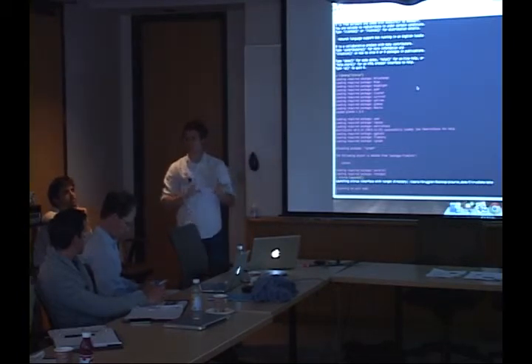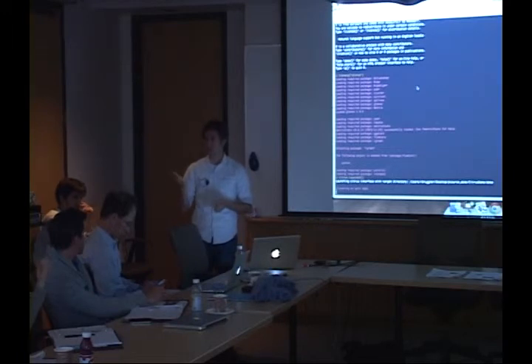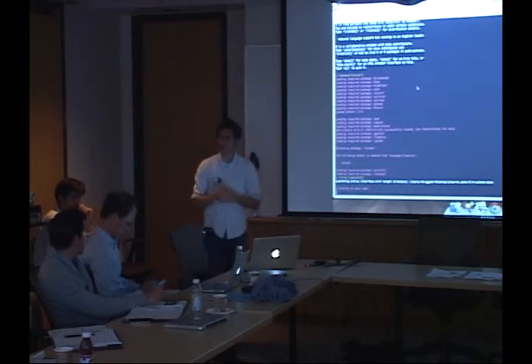That's at least my current intuition. If you're working with, say, 2-dimensional data or 3-dimensional data, then absolutely it makes a difference, and you have to scale the data so that those distributions line up between your measured markers.